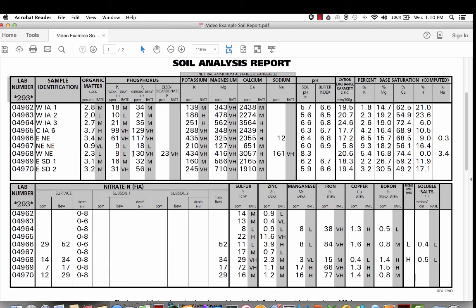I mentioned that the P2 Bray is about 4 times as acidic as the P1, so obviously it's not having so much of a problem finding phosphorus, but it looks like maybe the basic or caustic nature of the soil itself might have neutralized that P1 Bray extract solution in this case, especially when we see the P2 at 130.